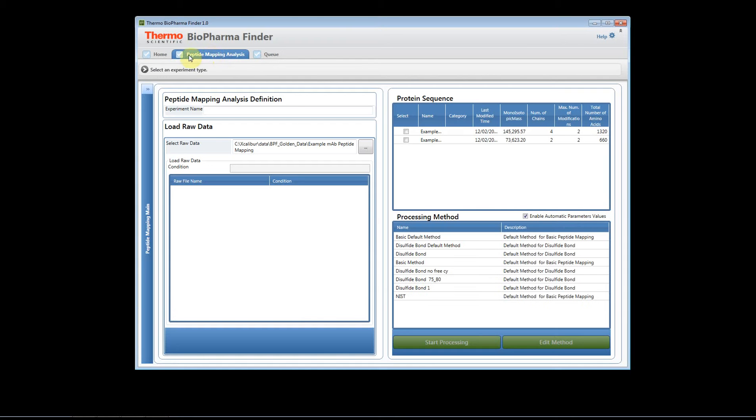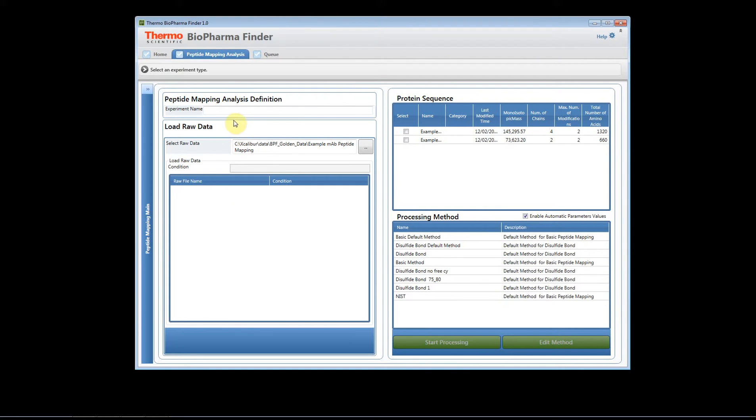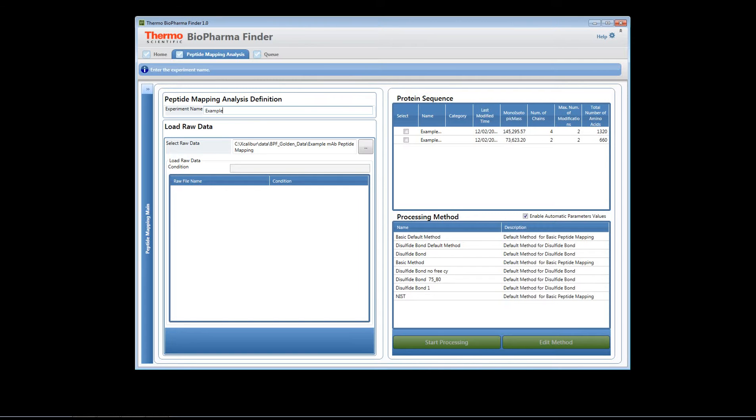If we go back to the peptide mapping analysis tab we're going to set up our experiment. In order to do this you need to begin by naming your experiment. In this case we're going to call it example.